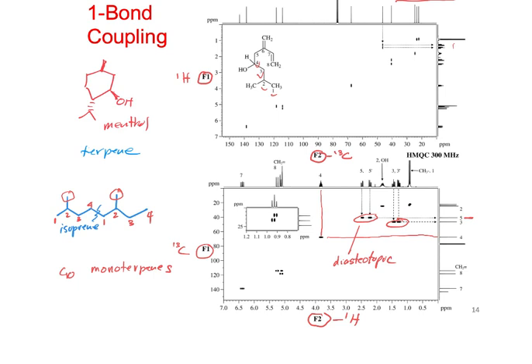Right, so we could number these 1, 2, 3, 4, 1, 2, 3, 4. So there's a methyl group on the 2 position each time. So knowing this kind of thing can help you put your structure together as well, because we know there should be some repeating unit like that.